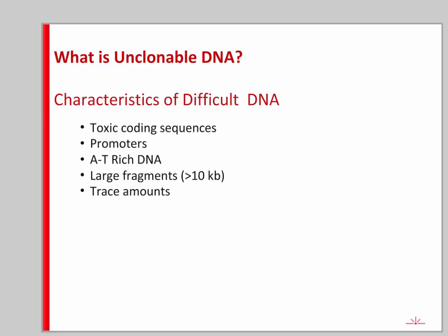What is unclonable DNA? There are several characteristic types that are typically problematic. First is toxic coding sequences — if your DNA is making something that kills the bacteria you're cloning it into, you won't get it easily. Promoters can be tough because they interfere with vector functions. AT-rich DNA is a very common problem. Large fragments can be difficult depending on length and AT content. Trace amounts of DNA are always tough to clone, but everything that clones difficult DNAs also works well with trace amounts, depending mostly on the quality of the vector prep.